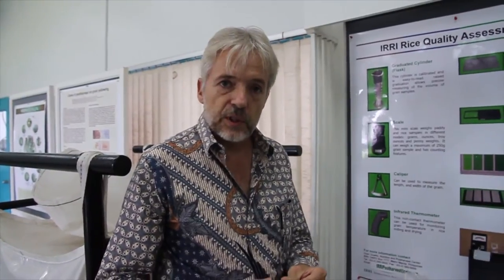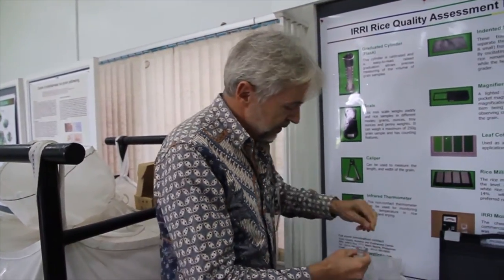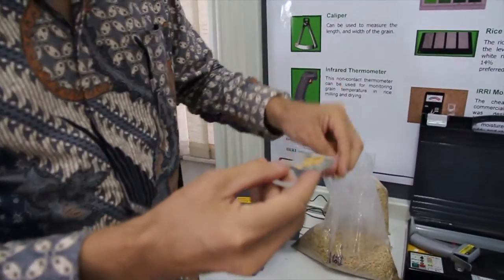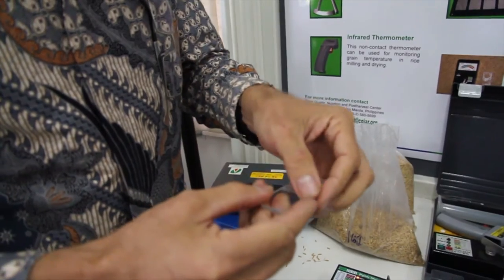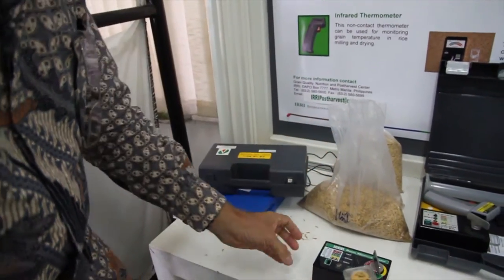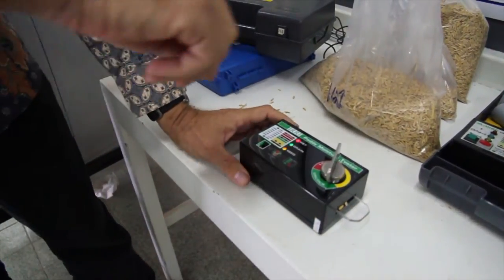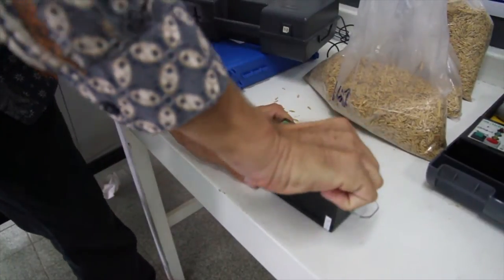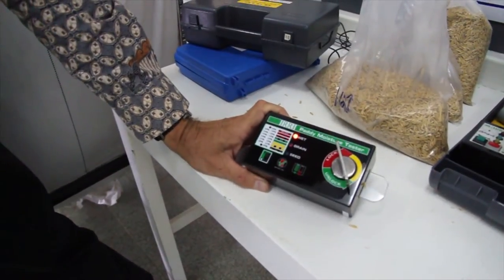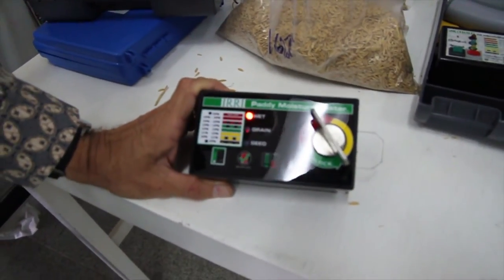I will demonstrate how the moisture meter works. We have a little spoon here where we put a couple of grains in, and at the moment I'm working with a sample that has 16% moisture content. We put the grains in, then insert it in the moisture tester, and crush the grains using the screw. As you can see, it shows us that the grain is too wet to be stored safely.